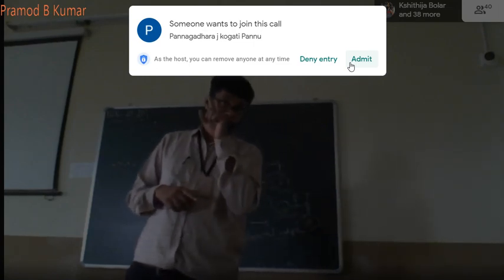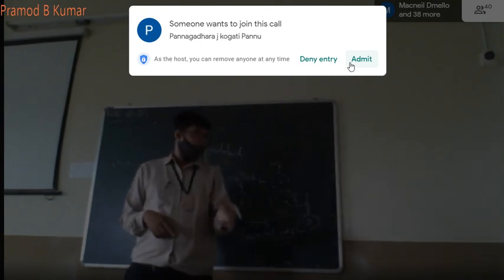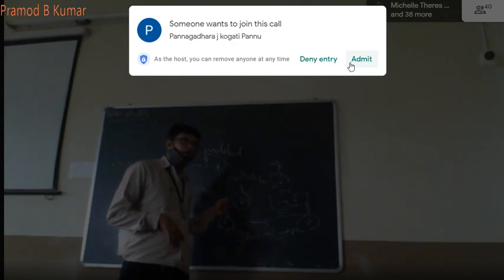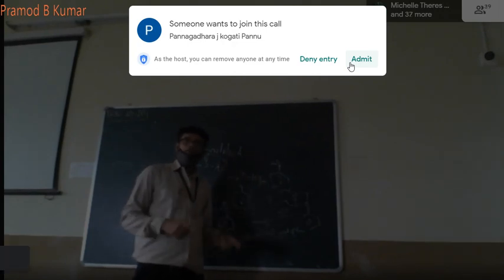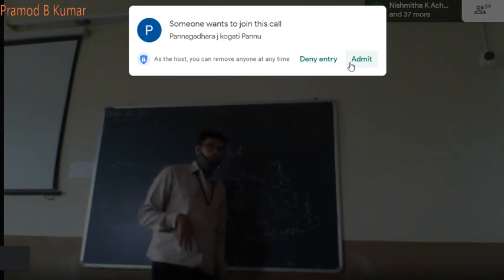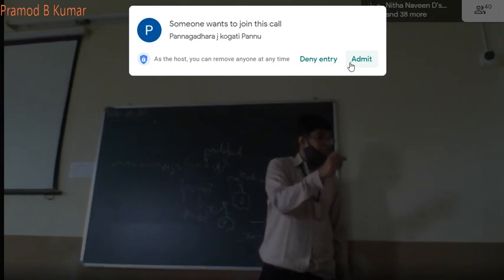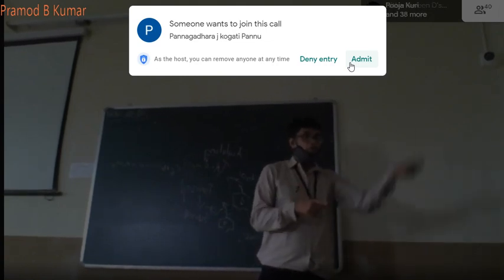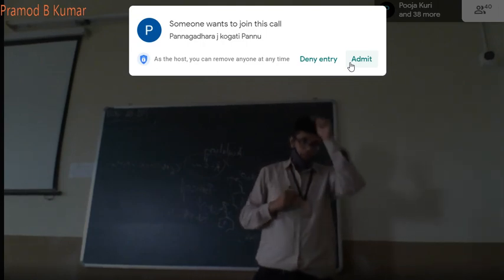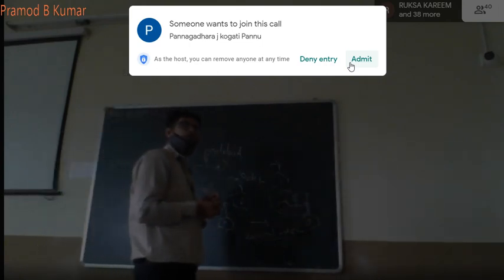And what is the first step? Generation of your sodium phenoxide. Instead of sodium and phenol, if you had added your benzoyl chloride first, instead of an ester you would have got an acid, because benzoyl chloride will react with NaOH to give sodium benzoate. That's why the first addition is of phenol and sodium hydroxide. To that solution you add benzoyl chloride. Remember this order of addition. Got it? Now let's go for the second one.